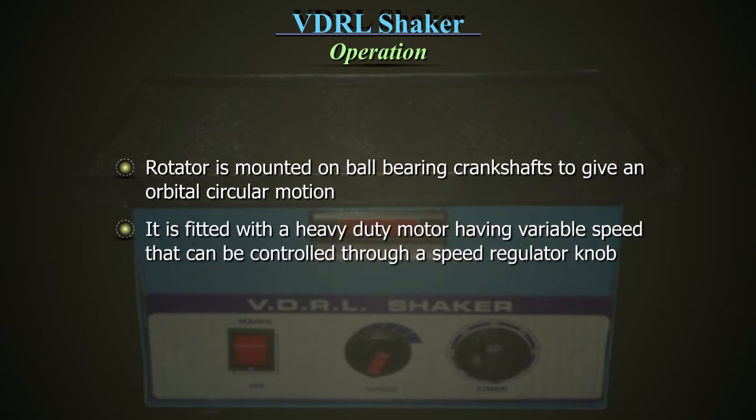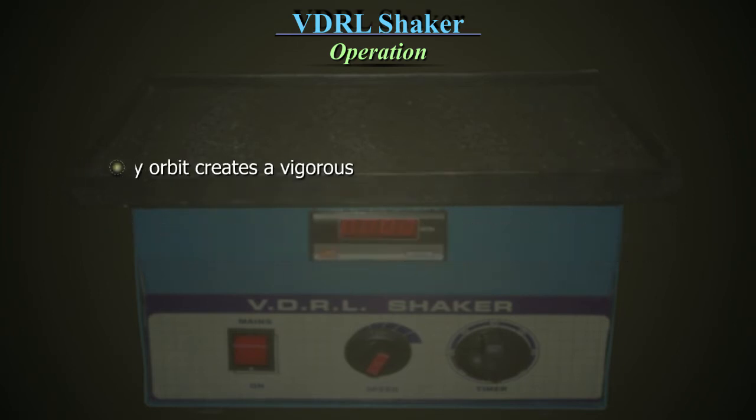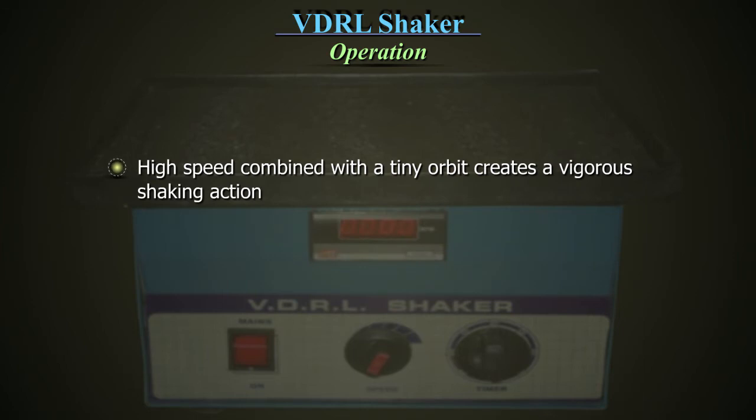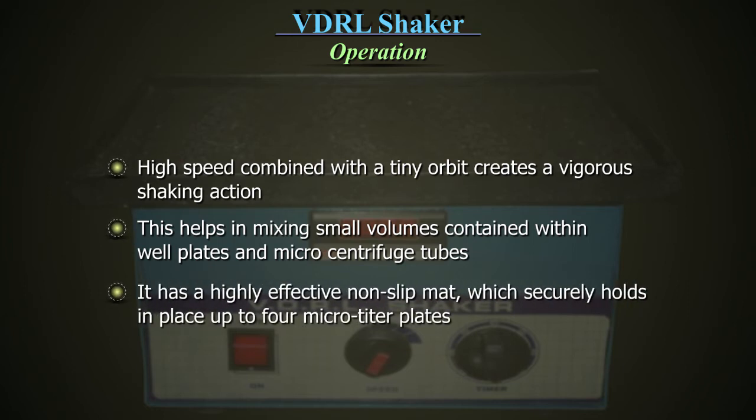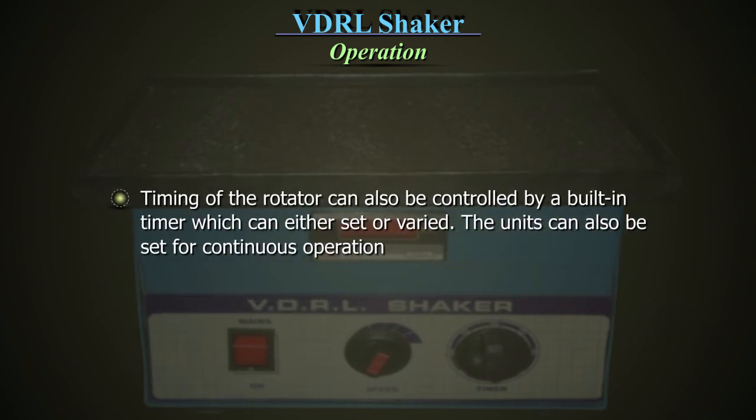It is fitted with a heavy duty motor having variable speed that can be controlled through a speed regulator knob. High speed combined with a tiny orbit creates a vigorous shaking action, which helps in mixing small volumes contained within well plates and microcentrifuge tubes. It has a highly effective non-slip mat which securely holds in place up to 4 micro-titer plates. The timing of the rotator can also be controlled by a built-in timer which can be either set or varied.